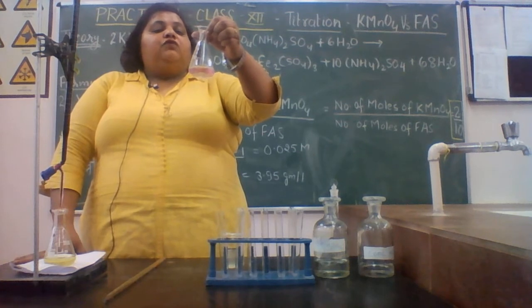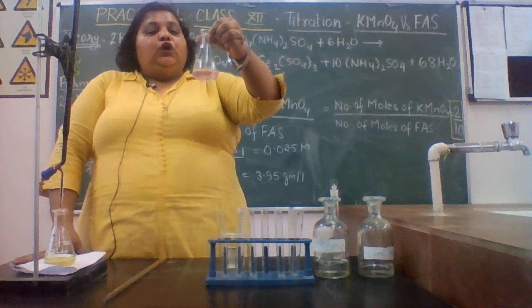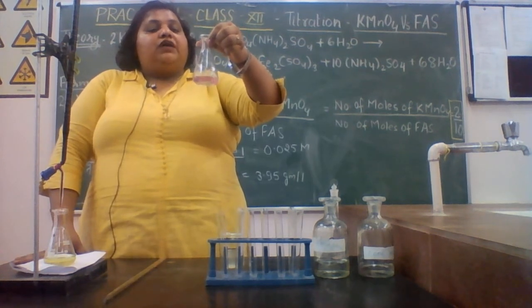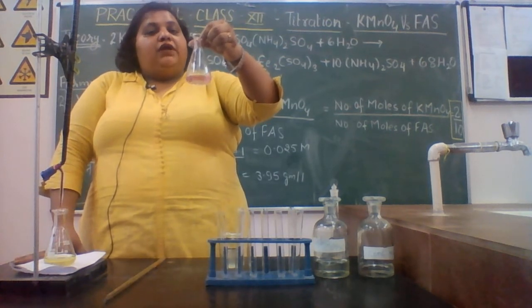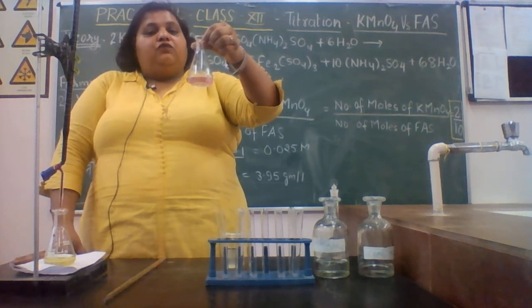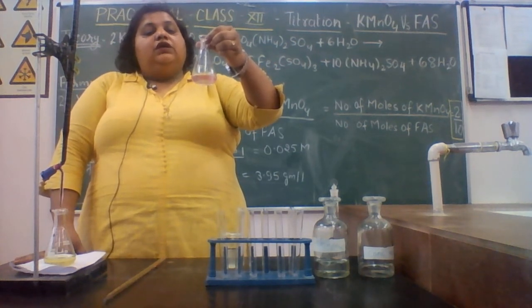Be very careful at the time of adding the solution, add it drop by drop, right. A single drop can change your color. The color of the solution may turn dark just by a single drop. So, be very careful at the time of adding the KMnO4 solution, right.